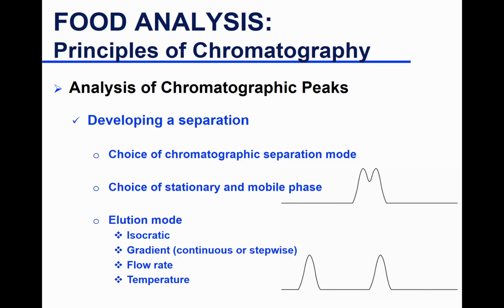So you choose your mode of separation, but there are multiple stationary phases and multiple mobile phases that you can choose from for the same application. So again, you start thinking about where should I start? What stationary phase? Again, looking at references can help you. You will pick a couple based on the references and try there. You start there.